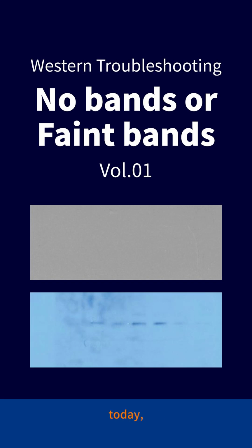Hi everybody. Today, are you having another headache with poor Western results? Western blot is a protein analysis technique commonly used in biochemistry, molecular biology, and genetic immunology. Anyone who has done Western knows that Western is not really a good experiment to do. It is just like a shot in the dark.